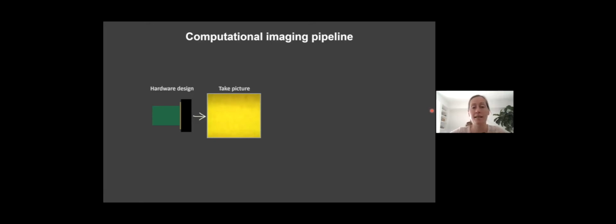But the light that hit the sensor is the same light that would have hit the sensor if the lens was there. And so the lens's only job is to bend the light rays in a particular way. So if you can do this sort of ray bending computationally, could you take this image and reconstruct your scene from it because it's the same light? The answer is practically not really.